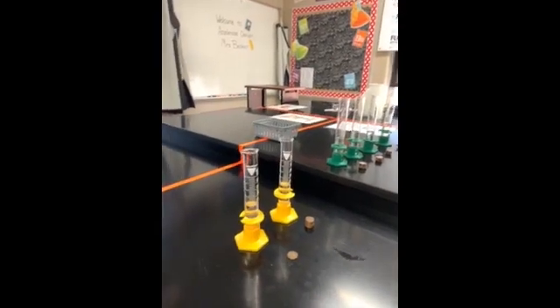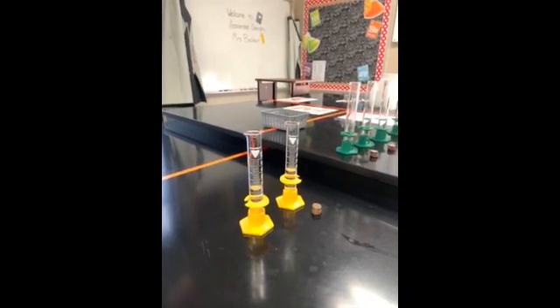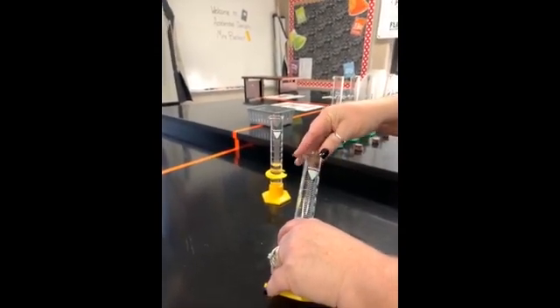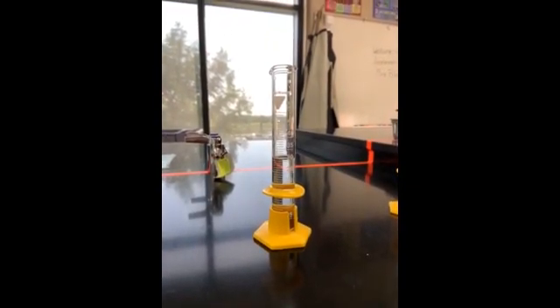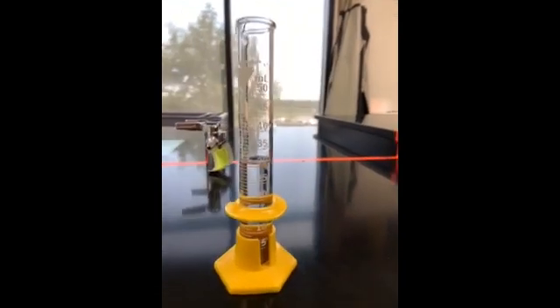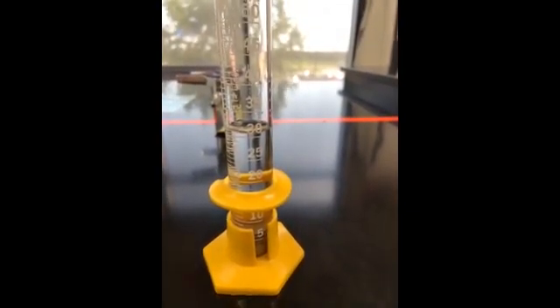All right, now let's do trial 3. Again, we are still on the pre-82 pennies. Trial 3, just the water, is 25.40. I'm going to add the pennies. And now, oh, it's twisted. Let me fix it. That looks like 30.19. It's just below that 30.2 mark. So I'm going to call it 30.19. So that was trial 3.